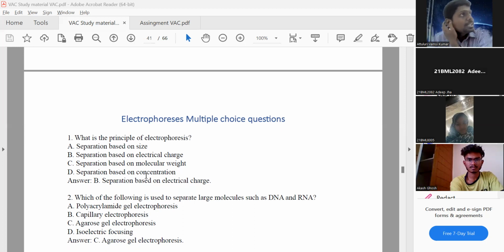Isoelectric focusing is an approach based on the pI of the molecule. Each and every molecule has its own designated charge, and once the applied external electricity is in sync with the molecular charge, only that corresponding molecule can be isolated from the heterogeneous population of molecules. Such an approach is called isoelectric focusing, and that is a really advanced method. Isoelectric focusing cannot be achieved with the traditional electrophoretic method. We need advanced equipment to do isoelectric focusing.